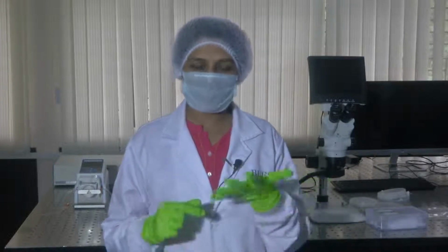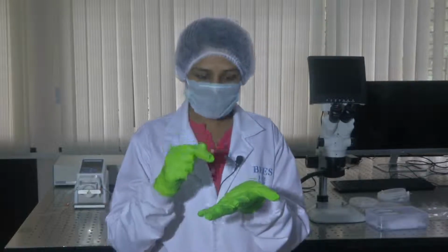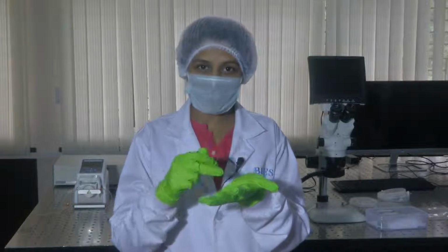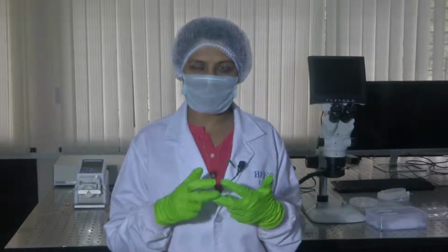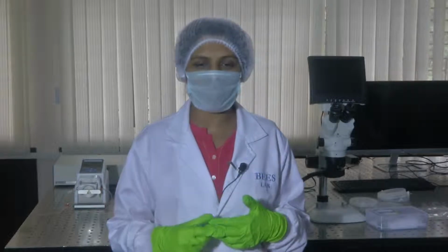Like I've already mentioned previously, when we are fabricating a microfluidic chip or a biochip, we have channels whose cross section, the channel width, is as small as 100 micron. So, how do we drive fluids in them, and why should you even drive fluids into a channel that small?